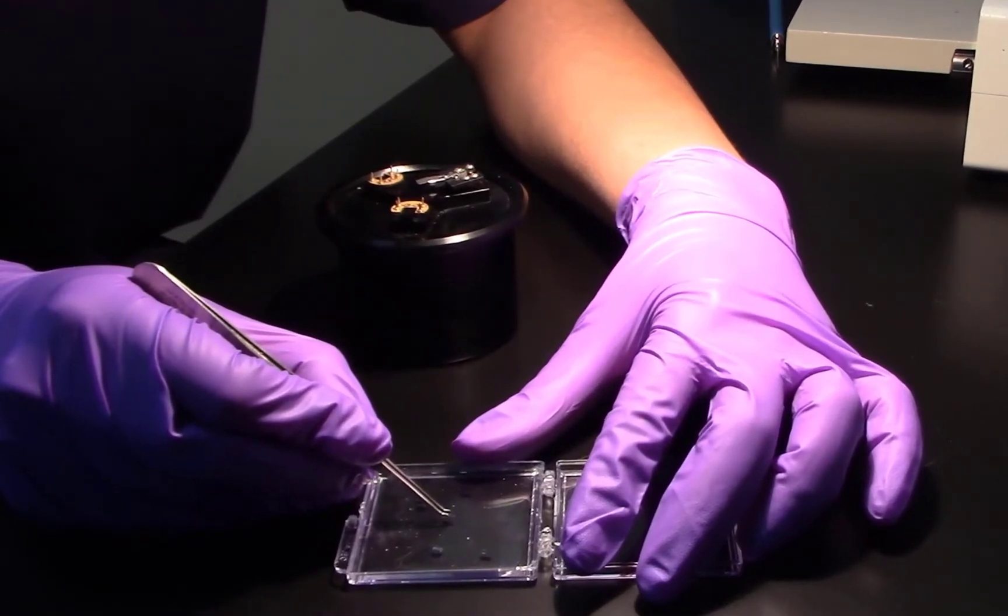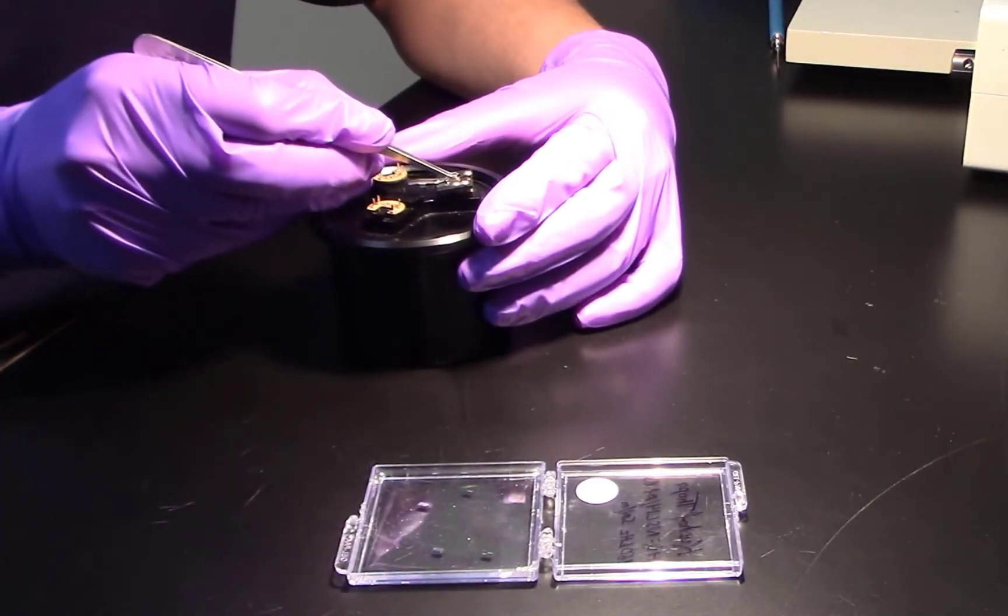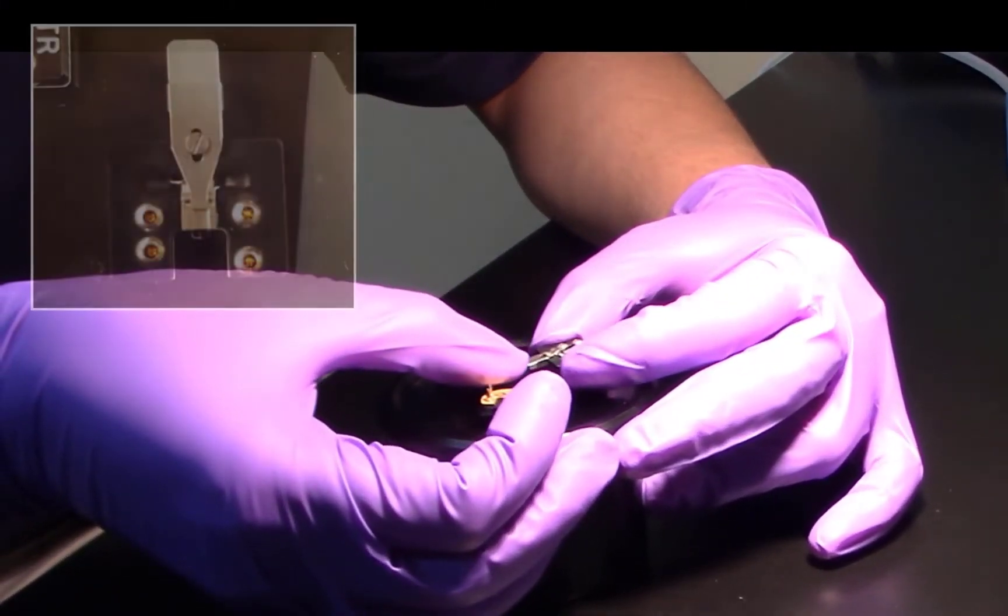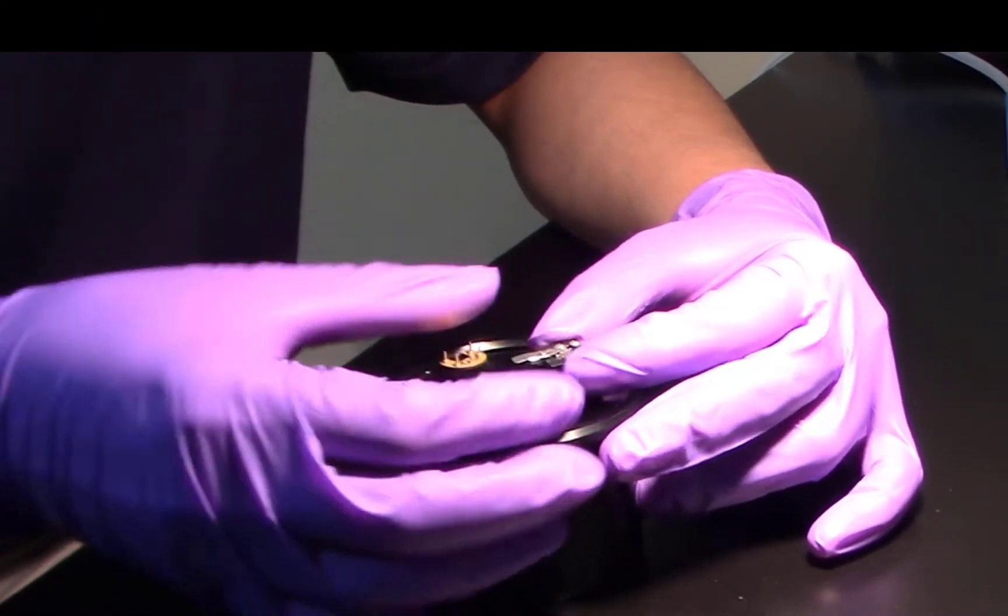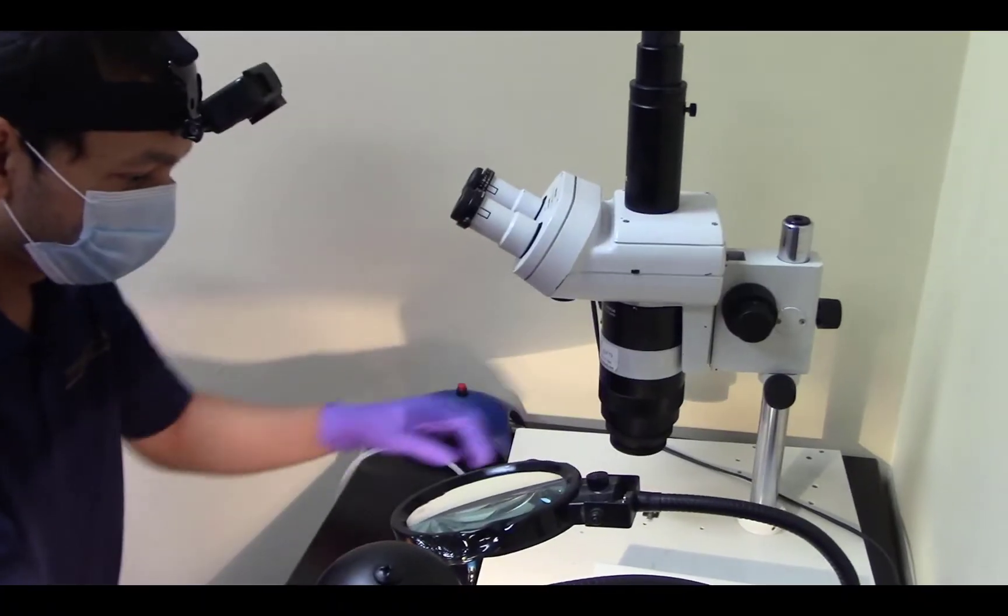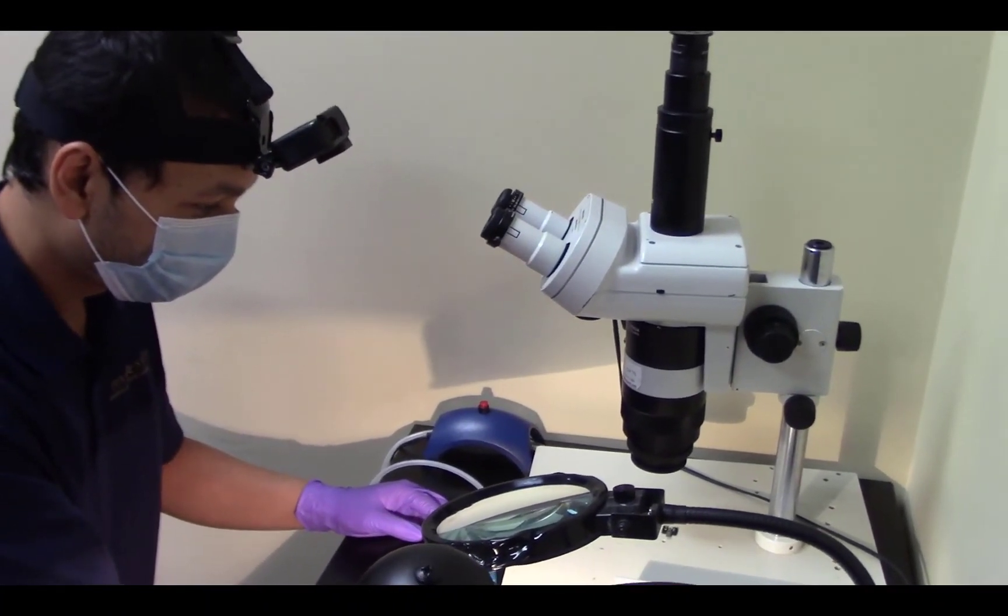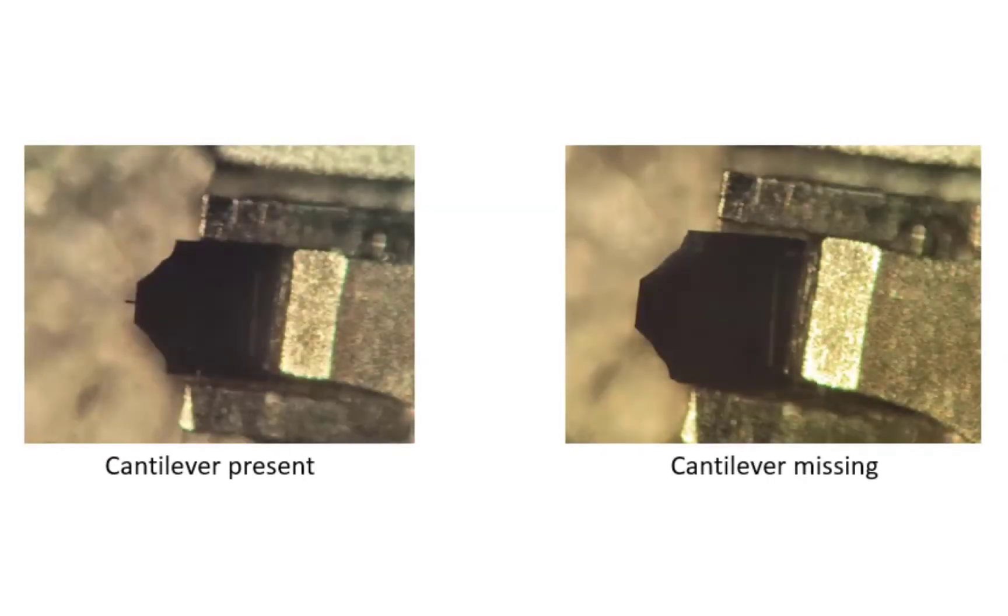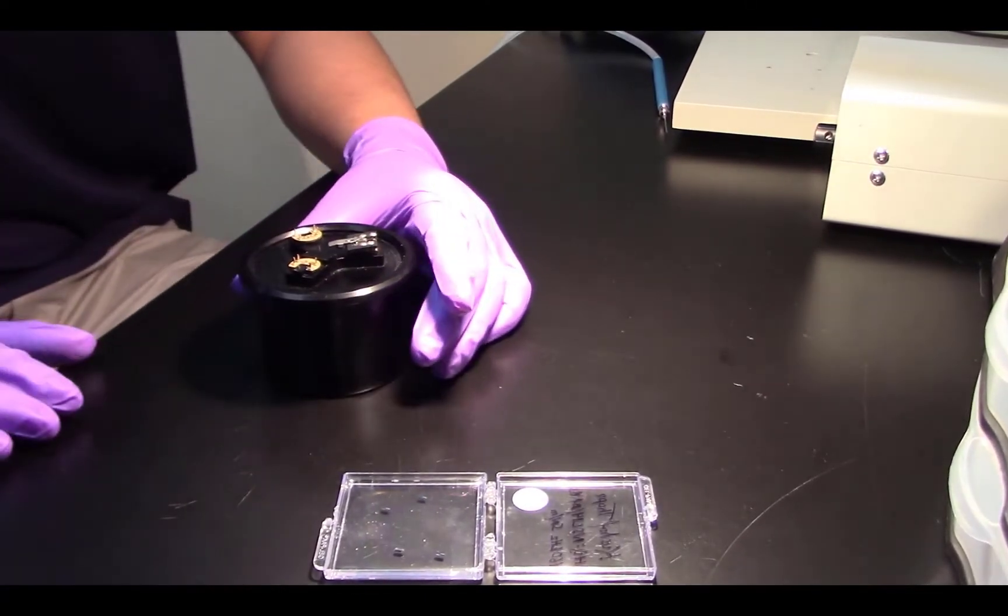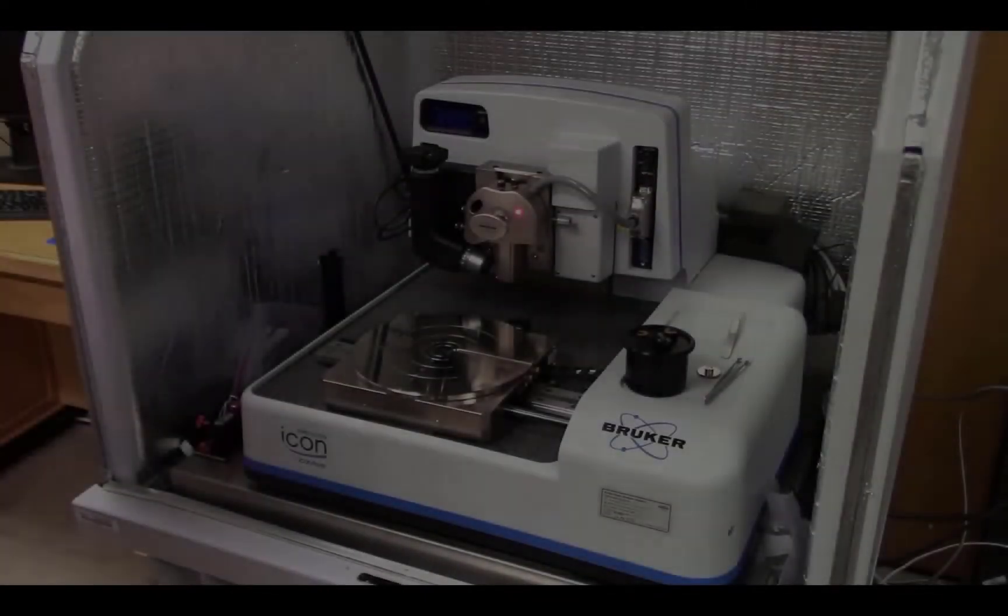Using tweezers, gently pick up a probe and place it onto the probe holder, and then carefully slide and position the spring clip to secure. Remove the probe holder and examine it under magnification using the stereo microscope in the preparation area to verify that the probe is properly mounted and the cantilever is present. Once done, remount the probe holder in the base and return to the AFM.